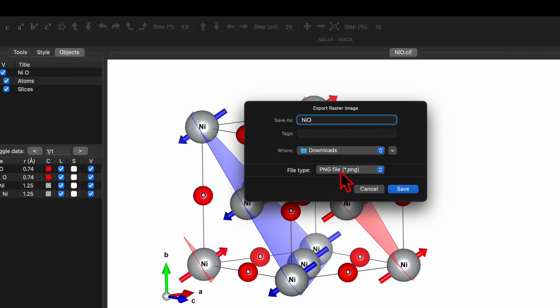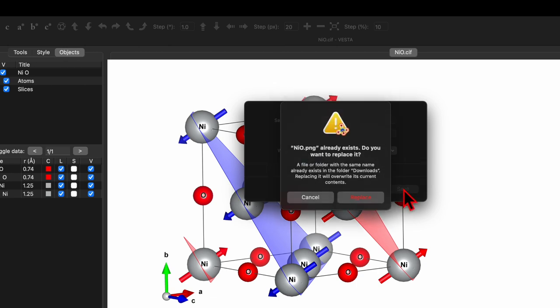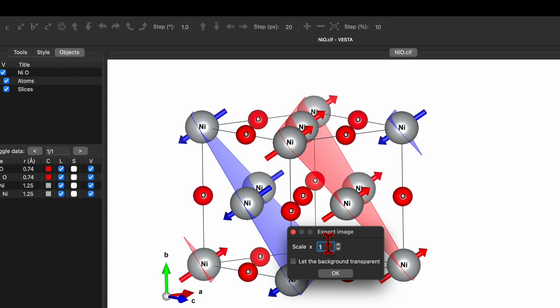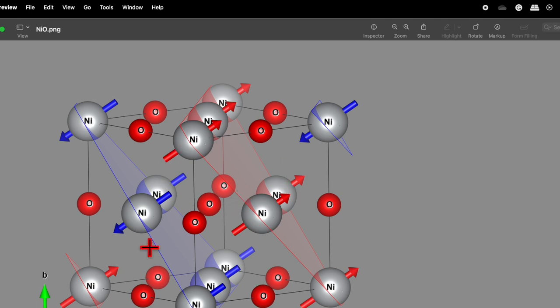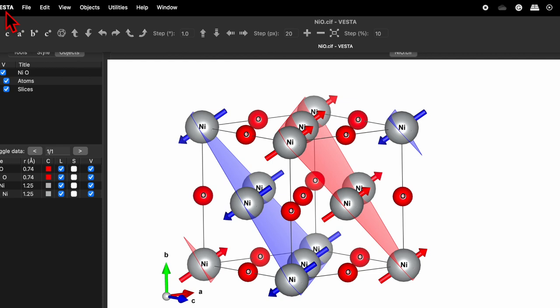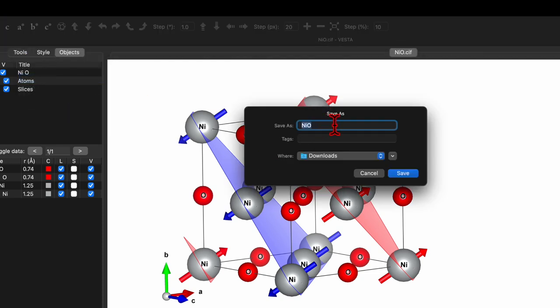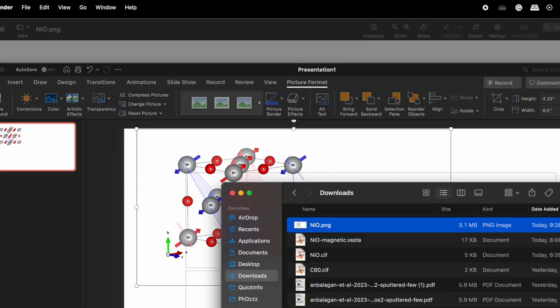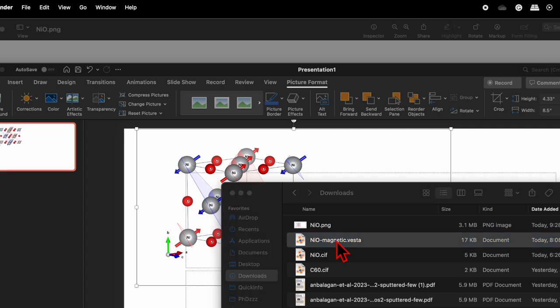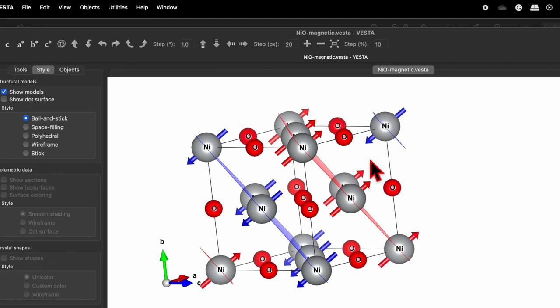This is nickel oxide in PNG file format — you can choose various file formats, but I want PNG because it allows exporting with a transparent background. Click Save. You can set the scale from 1 to 5: higher scale means higher resolution but larger file size — let's set 3 and keep the background transparent. Click OK. In the downloads folder you can see the NiO PNG file: this is the nickel oxide unit cell with the compass, magnetic structure, and transparent background. To save the VESTA file, go to File > Save As, name it NiO_magnetic, and save.